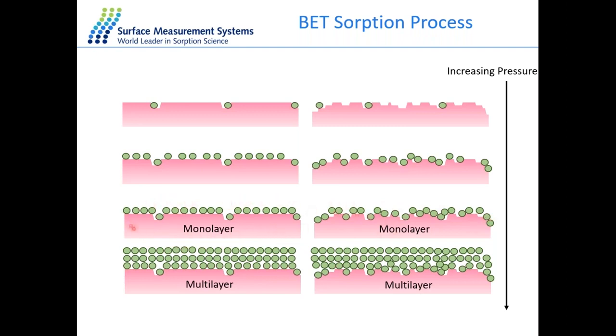So we can tell from the isotherm shape that we have the right adsorbate-solid interactions, and we can apply the right equation. And then the BET equation assumes after that first monolayer, everything grows layer by layer by layer. So it's essentially like snow falling on top of the ground. It just piles up on top. And each of these layers are identical in terms of the thermodynamics.